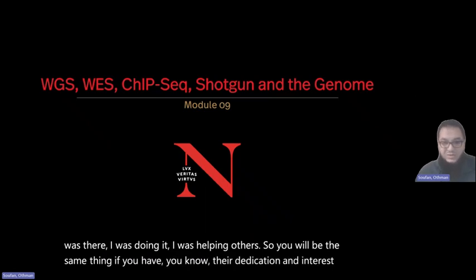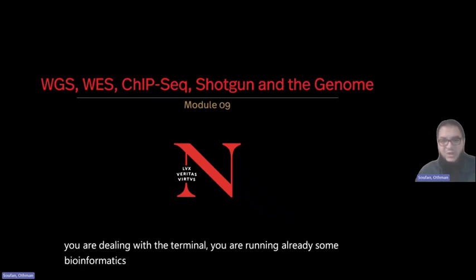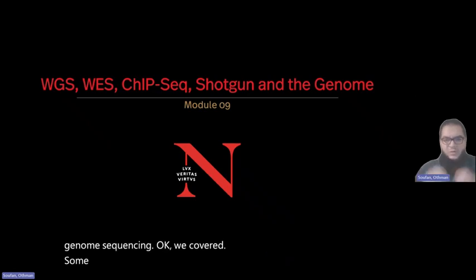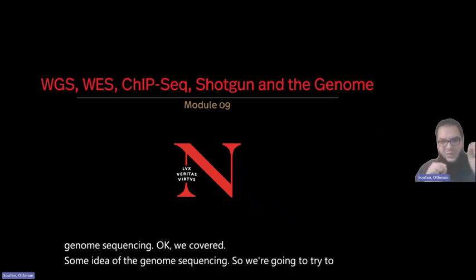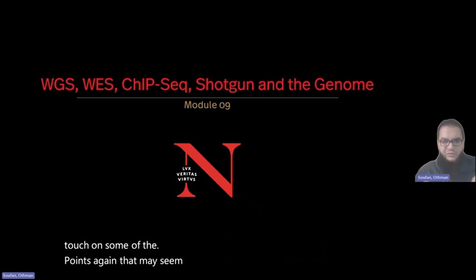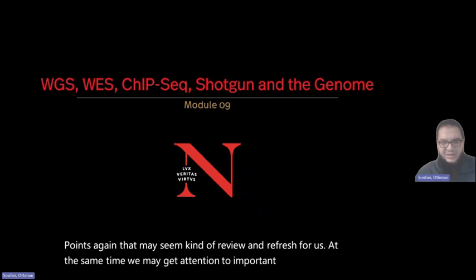So you are dealing with the terminal, and you are already running some bioinformatics software and tools. Today, we're going to focus on genome sequencing. We covered some ideas of genome sequencing, so we're going to touch on some of the points again, that may seem like a review and refresher. At the same time, we may draw attention to important ideas, as I've mentioned.